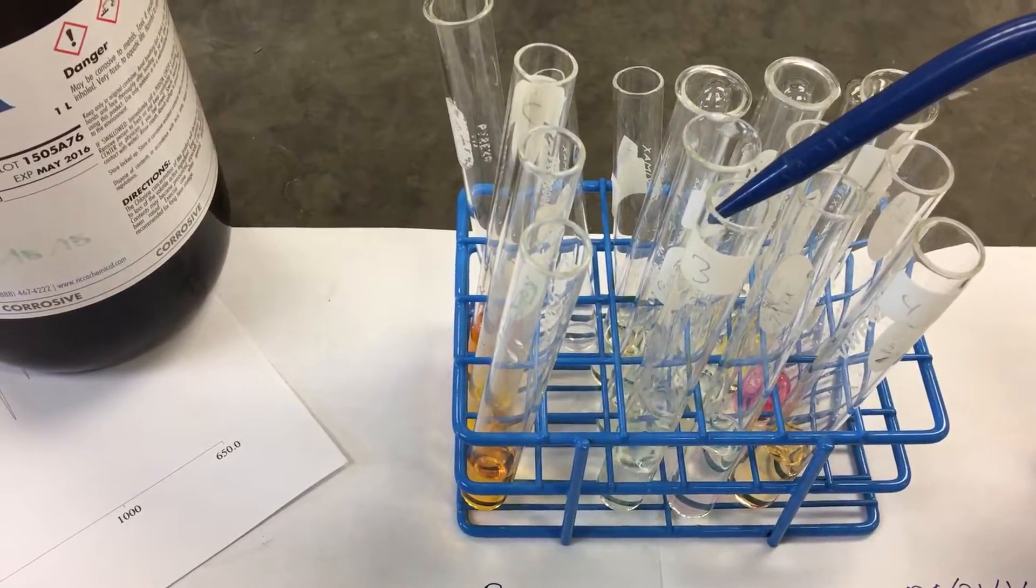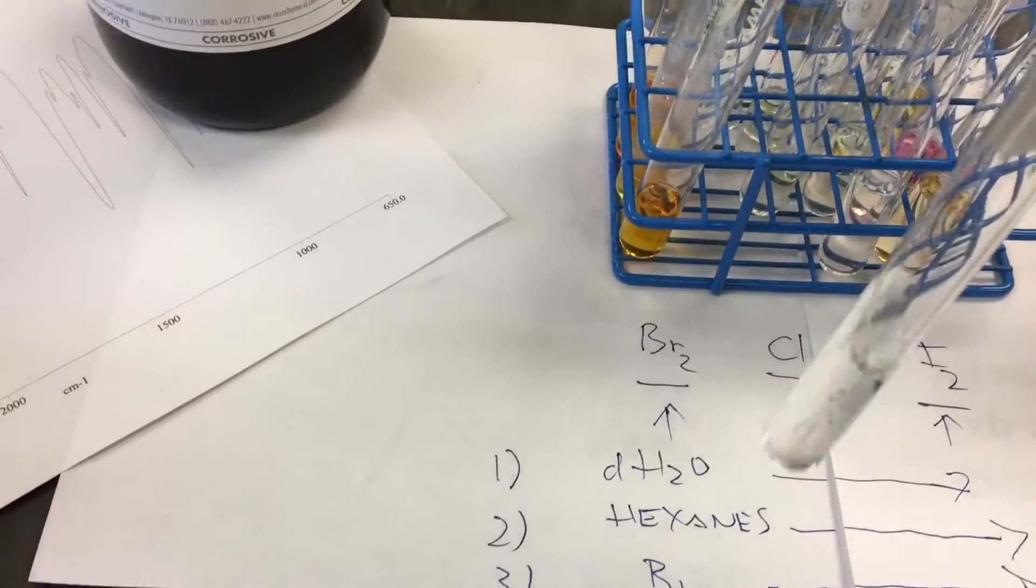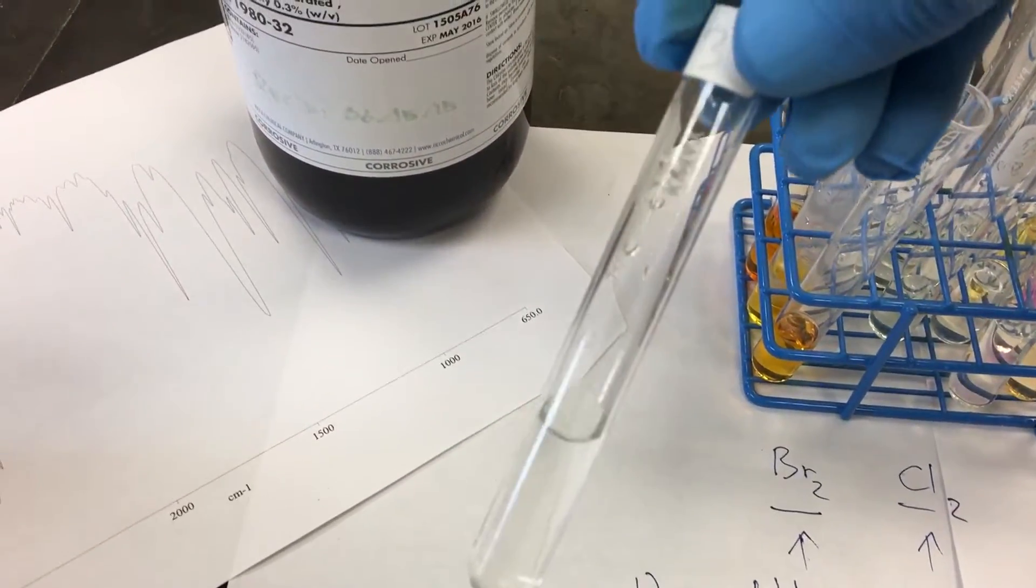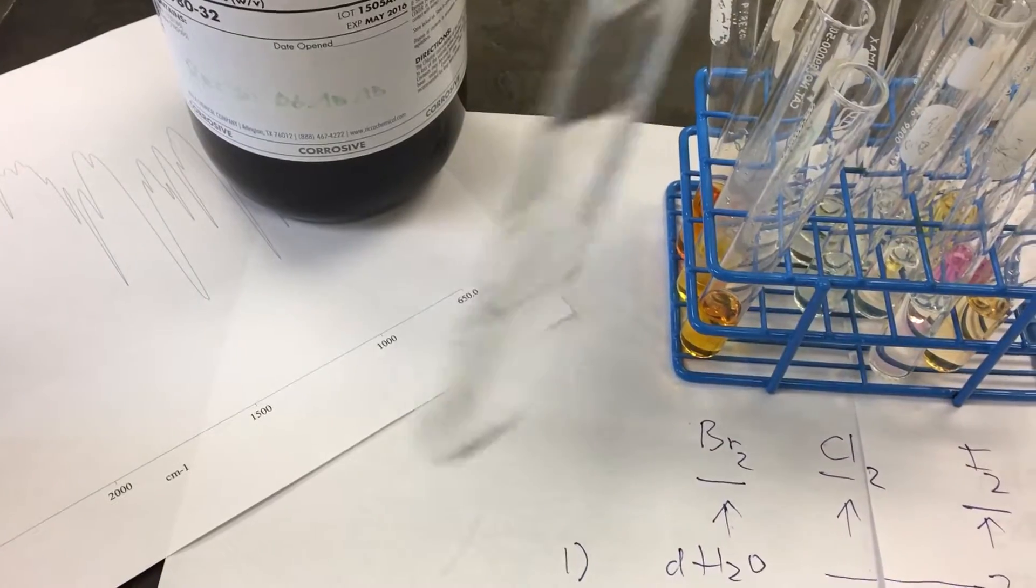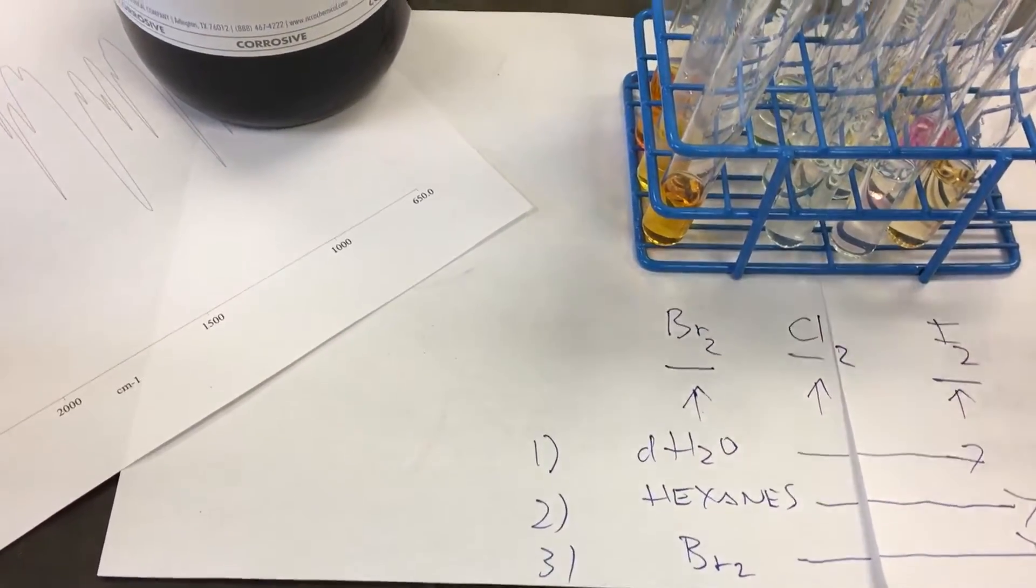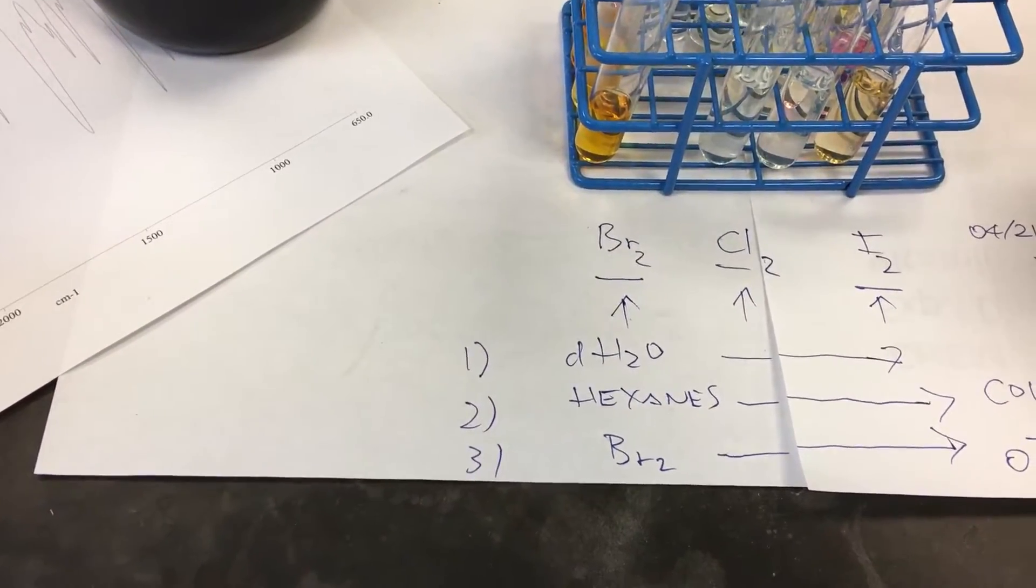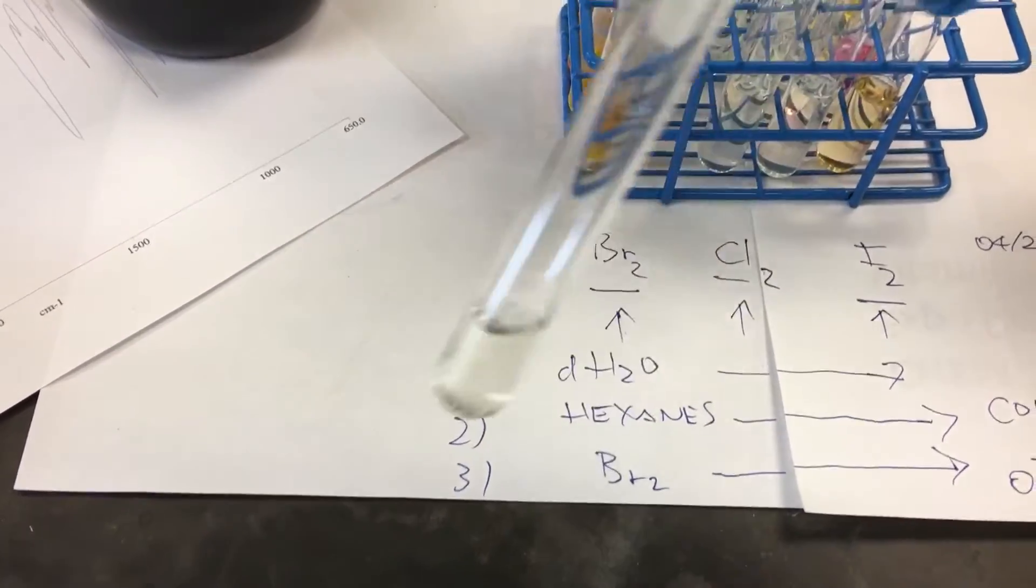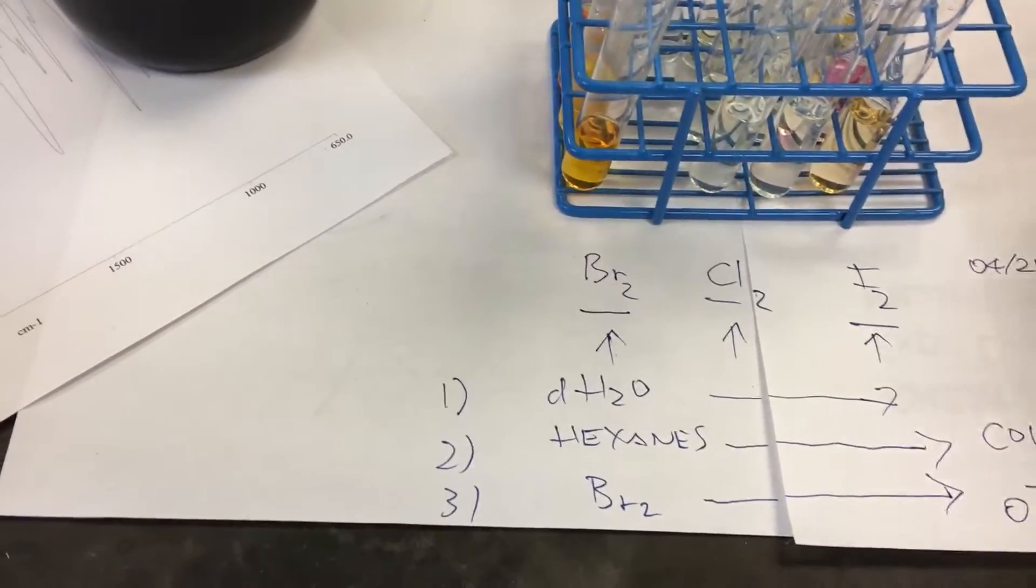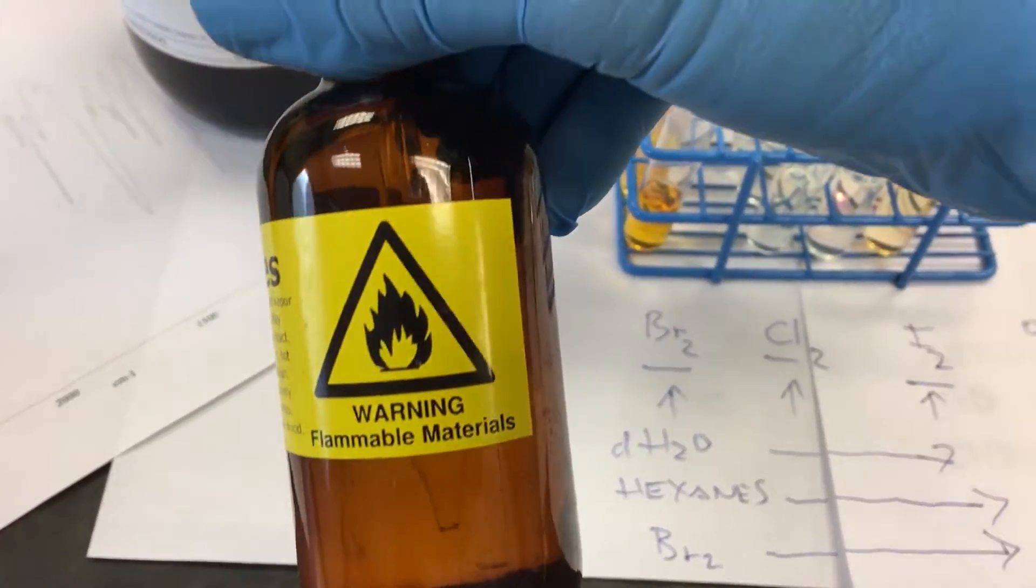Next one up, we're going to retest the chlorine satellite water. I have it in here with the hexanes. Right there. Make sure this one is flammable materials.